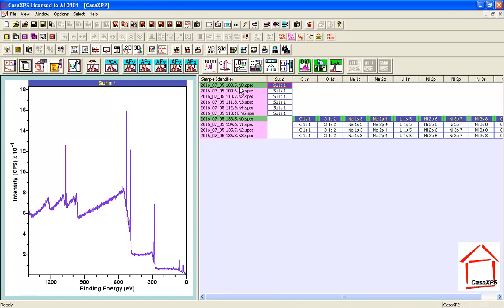...so this one I've chosen is labeled N0, the fact that they were measured at different times and placed in different files means that the file name is different in terms of this sample identifier, and hence they are on different rows.